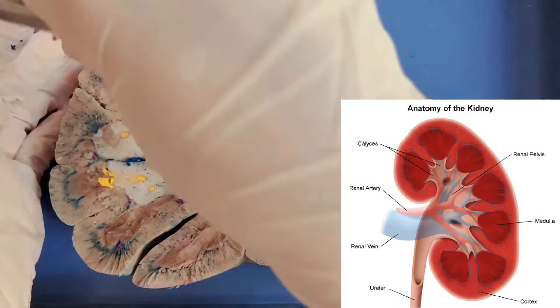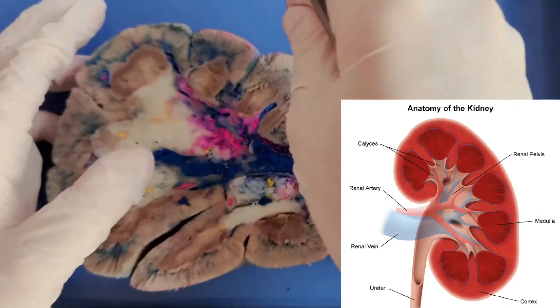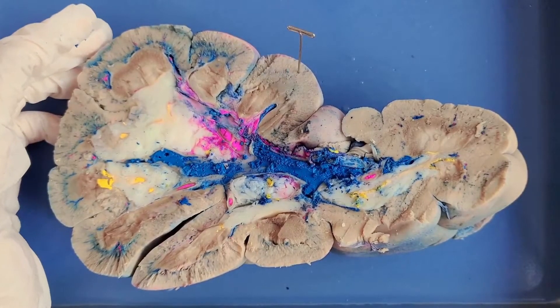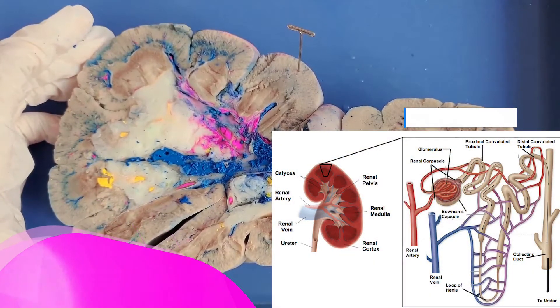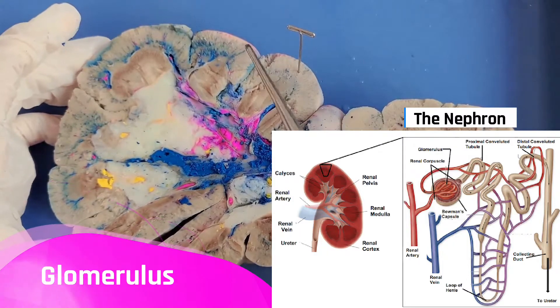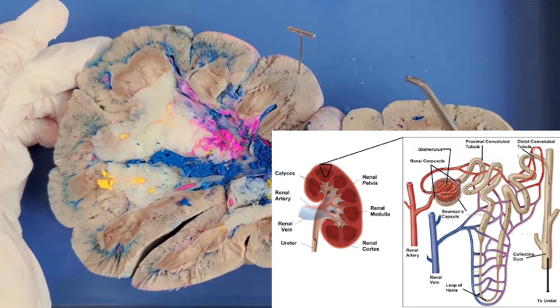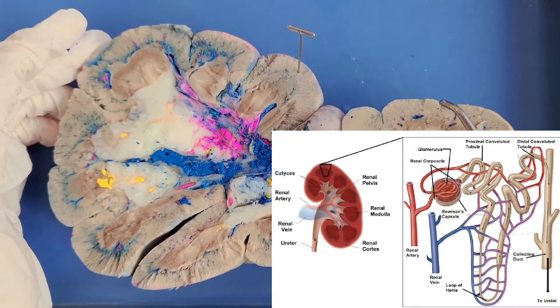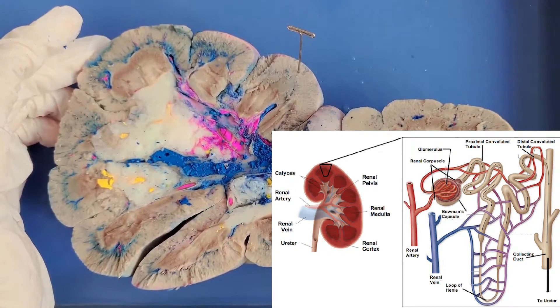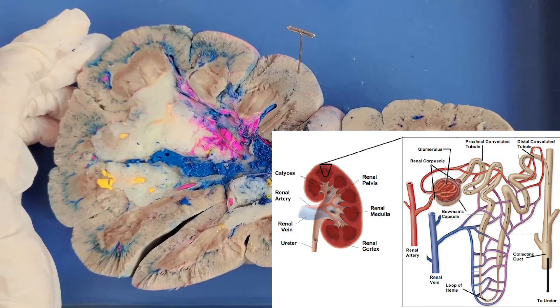So this is the cortex right here, where the pin is. The functional unit of the kidney is a structure called a nephron. Blood first enters the nephron here in the cortex through a structure called the glomerulus. You can see all of the blood vessels running through the cortex. The glomerulus acts like a sieve — it catches many things in the blood, like red blood cells or larger proteins. Around 20% of the fluid in the blood passes through the glomerulus and is called the filtrate. The filtrate then enters the Bowman's capsule, which is basically a cup that surrounds the glomerulus to catch whatever passes through.